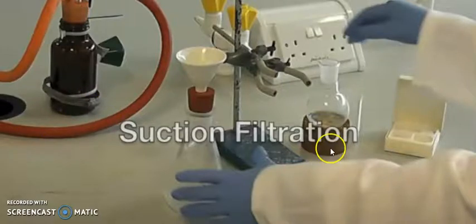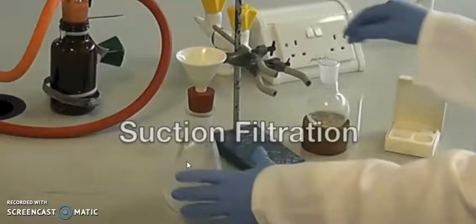Before that, you have your sample here, you want to filter this one. Make this setup. This is an Erlenmeyer flask, rubber tubing, and then Buchner funnel.